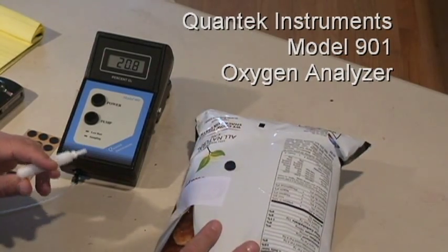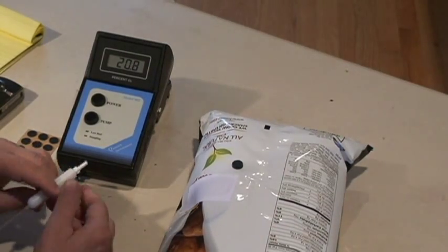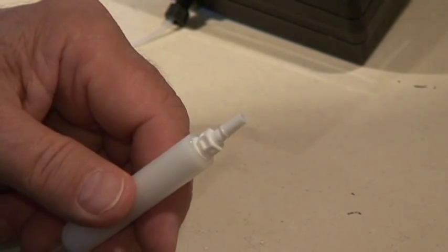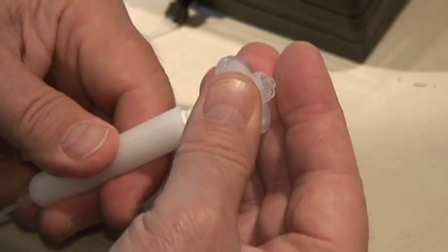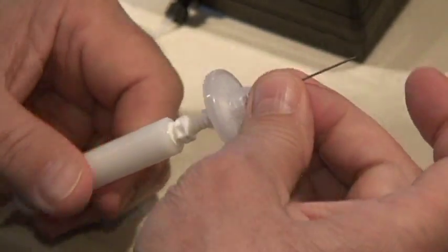What we're going to do this morning is test a bag of chips to see what the residual oxygen level is. We start by inserting a filter on the tip of the probe, which keeps dust and particulate matter out of the sensor.